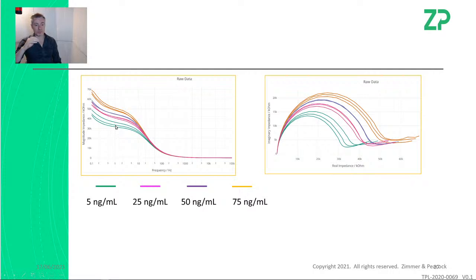So this is small volume manufacturing. It's very hard to make reproducible sensors with small lab-based manufacturing, but we are able to pull it off just because of the experience of the team. But of course, this is 5 nanograms. The questioner was asking about picograms, but this is the data that I can put into the public domain. It does tell you about our ability to make repeatable sensors and measure them by EIS.